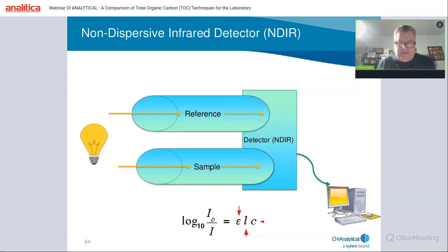Concentration measurements are based on the difference in the IR absorbance between a reference and an analyte signal. Reference and analyte sample channels measure carbon dioxide in a single path through use of narrow band optical filters with appropriately selected bands. The concentration of carbon dioxide present in the optical path will result in reduction of IR intensity as it traverses the flow cell.